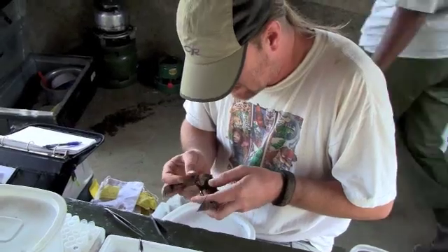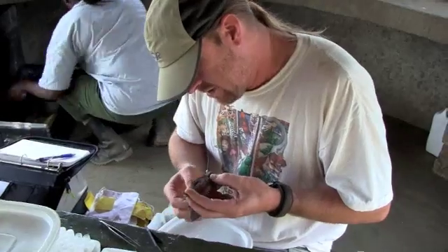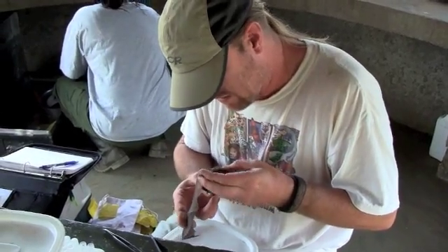Once I do that, I start from the hind and blow forward into the fur to uncover batflies that are lurking in there. Sometimes fleas — haven't found any on this species.